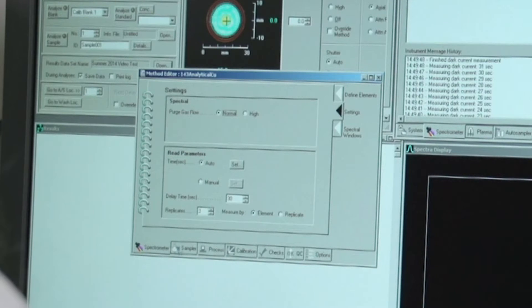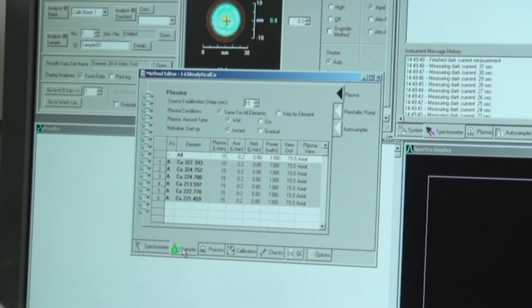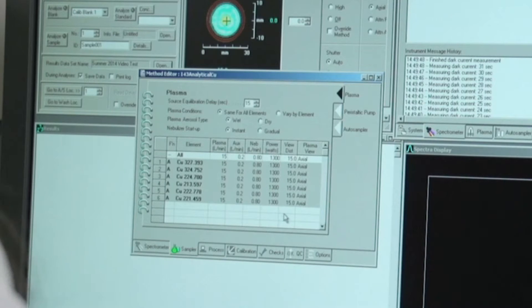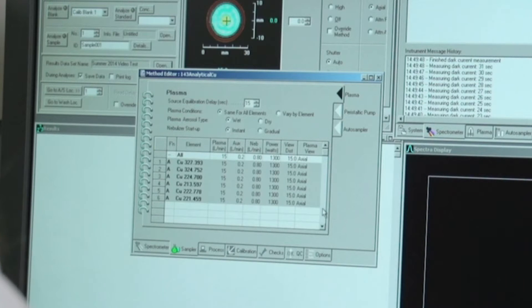Now go down to the sampler tab and check that the pump is reading 1.5 mL per minute.